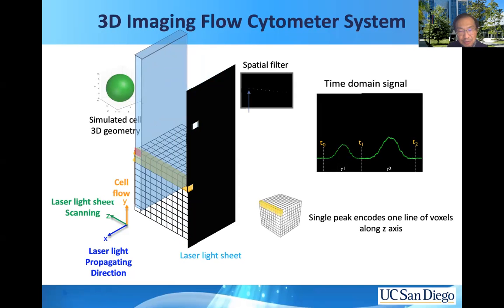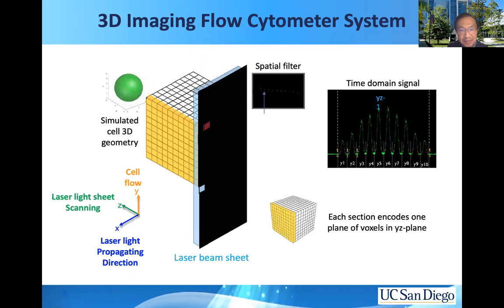As the cell continues to travel and the scanning continues, after the cell passes the first pinhole and enters the second pinhole, the cell has already been scanned, in this example, 10 times, and that creates a waveform like this by the PMT. This waveform can be transformed through a spatial-temporal transformation into the image of this single slice. And now the cell has flown to the second pinhole.